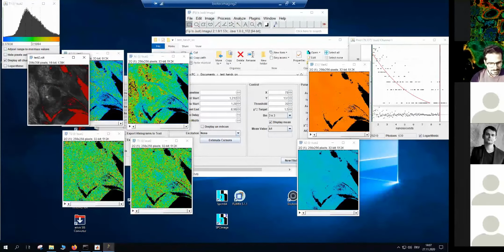Yeah, okay. I will say it's not the same thing, I think, because here binning the lifetimes is just binning the channels of the histogram. And in the phasor plot, when you're doing the wavelet filtering, you're basically doing a smoothing of the phasor dot. You need to imagine that the phasor is mostly like a 3D histogram. You're just looking at it from the top and applying some filter to it. So it's not the same, I believe, but I might be wrong. It's a question worth asking the Leica people in this case.